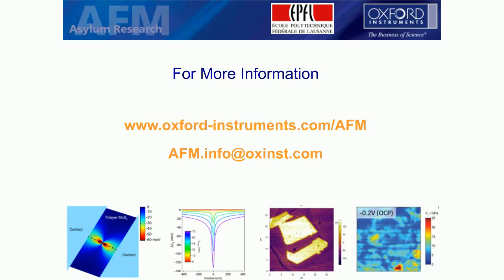But then we had some problems in fixing that into the AFM, using some standard chip sockets, so we didn't have enough space to reach the entire chip. And now we actually just take a silicon chip, and when we make a device, we put the contacts on the edge, and then we use little pogo pins. So we machine some little holder with pogo pins that contact those pads.